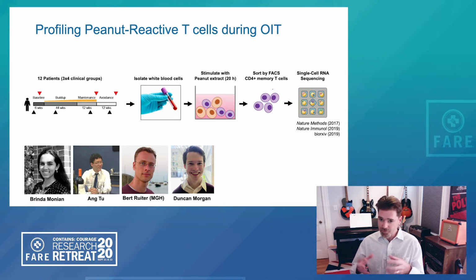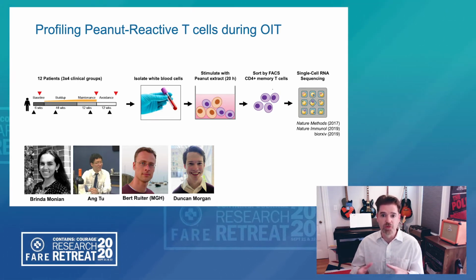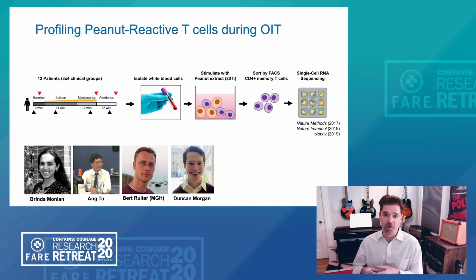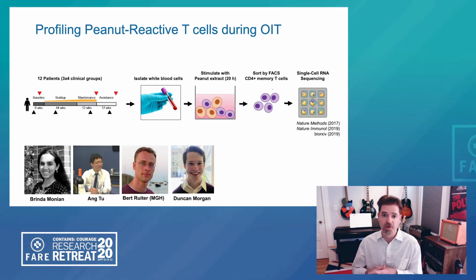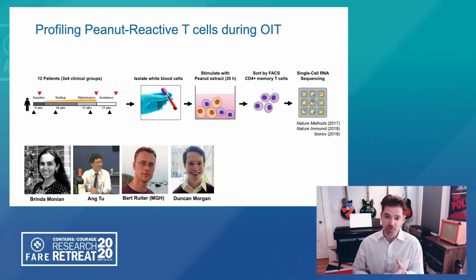We have also developed a new strategy for the chemistries that are used that advance over the original ones, that now allow us, with high fidelity, to capture the cytokines, transcription factors, and surface cell markers that are highly associated with the phenotypes of T cells that we know from immunology. Some of the original chemistries in this space for high throughput sequencing have not allowed for deep resolution of those factors, and the new chemistries that we've reported on recently in bioRxiv detail strategies for being able to uncover those pieces of information that are critical for being able to subset these populations. So now, in hand with the ability to identify deep profiles of the transcriptomes of single T cells as well as their TCRs, we have an ability to track clonotypes and their phenotypic changes in time.